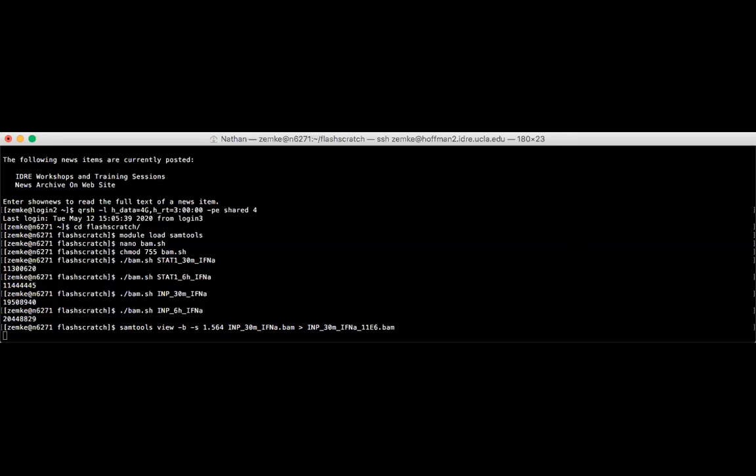Yeah, so again, for some reason, with the version of samtools that we're using, you have to put 1 before the 0.564, and I'm not clear on why that is, but that's just what the parameter calls for. I remember looking it up at one point, but I don't remember what it was. I know in a different version of samtools, you enter the fraction in a different way. So that one finished.